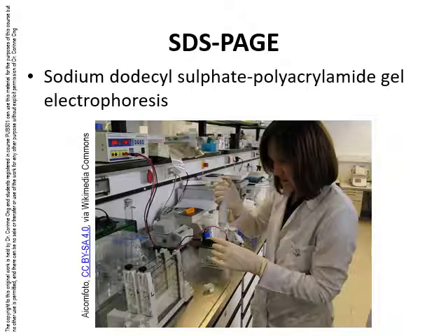One of the most common types of electrophoresis is called SDS-PAGE, which stands for sodium dodecyl sulfate polyacrylamide gel electrophoresis. In the picture, you can see a number of vertical gel electrophoresis systems. There is one closest to the left with a large tank, and in front of this tank, two gel casting apparatus. To the right is a smaller tank. The small systems are very useful for quick runs that provide initial data. On the shelf above is a power pack that provides electric current to run the electrophoresis system.